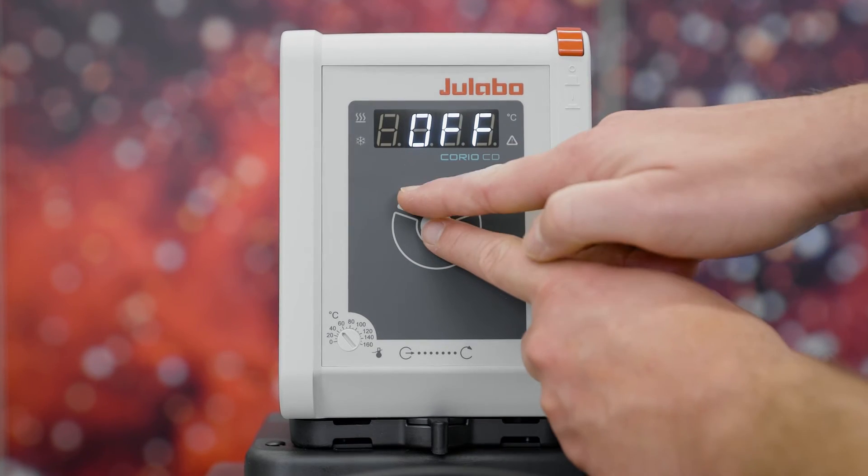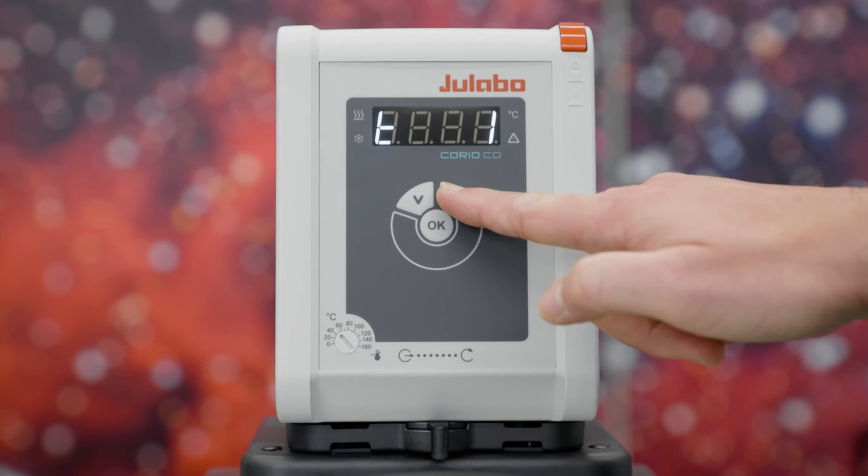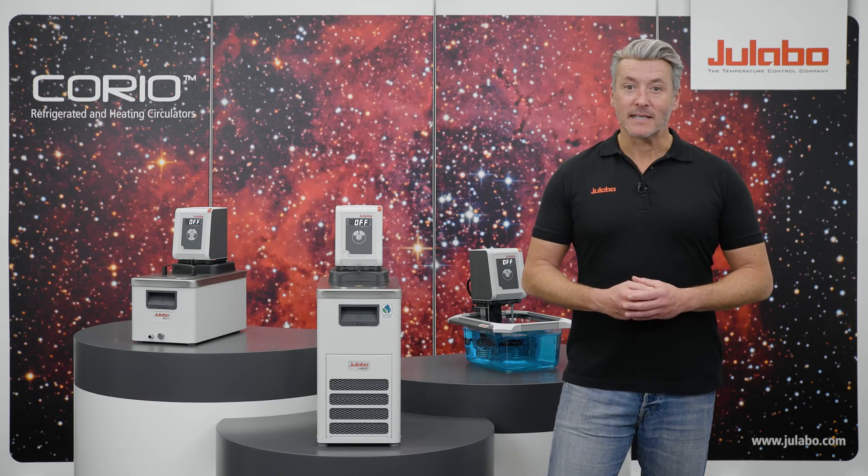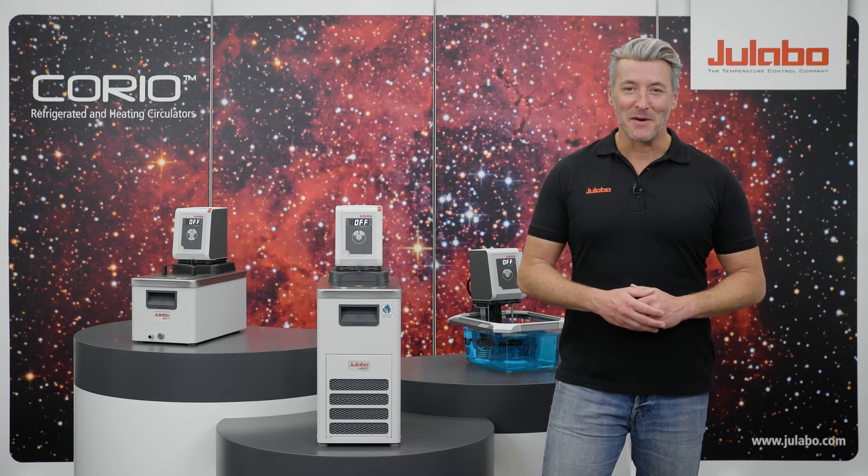Simply press the down arrow and OK button simultaneously. The display will show T0 and you can set the minutes. The setpoint temperature will maintain for the programmed time. After the set duration has elapsed, the device automatically switches to standby mode.